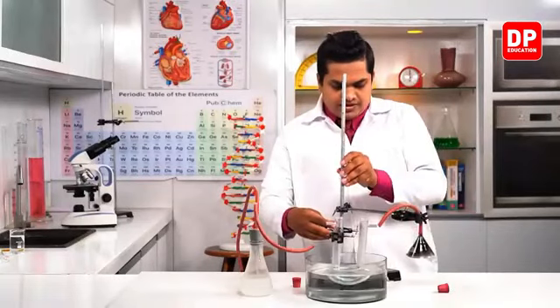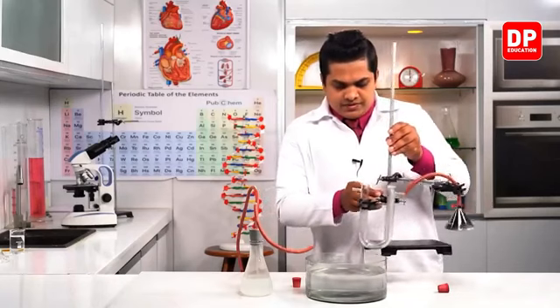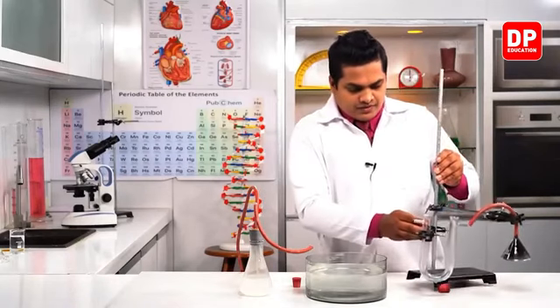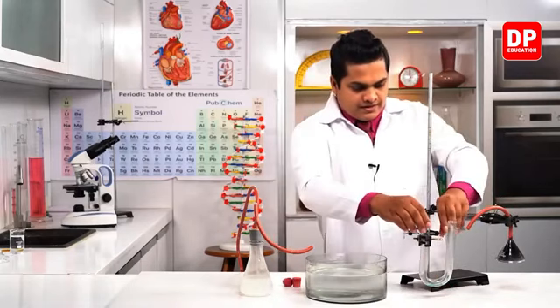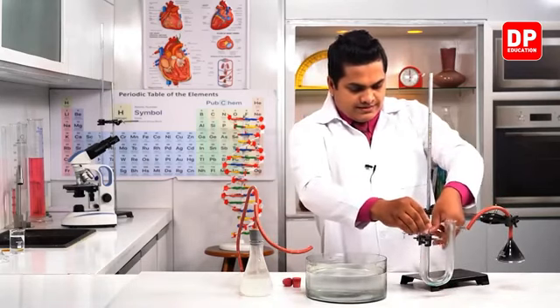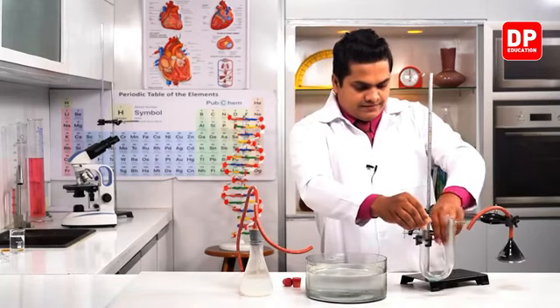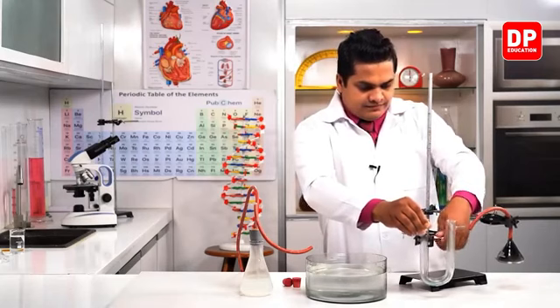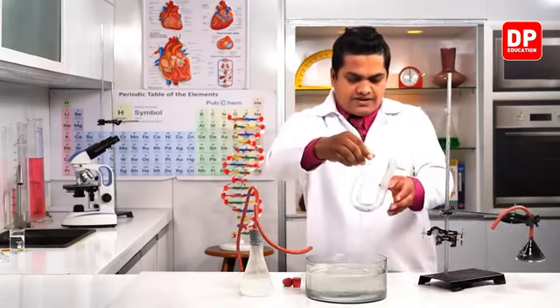Okay then. So here you can observe the color of the copper sulfate right now.